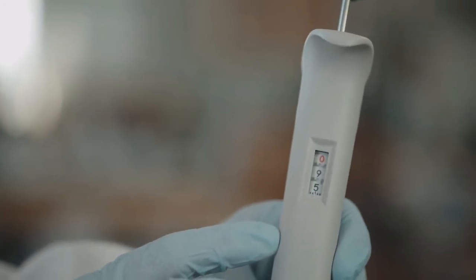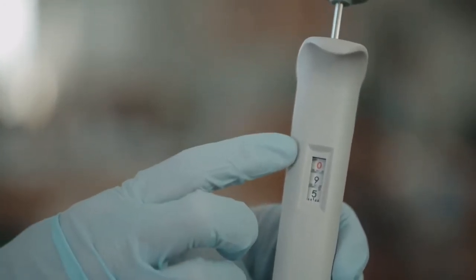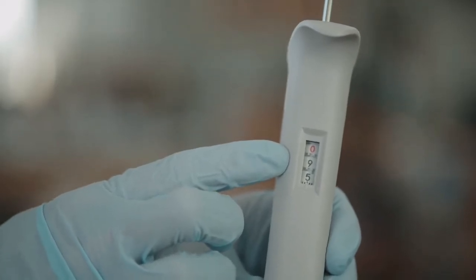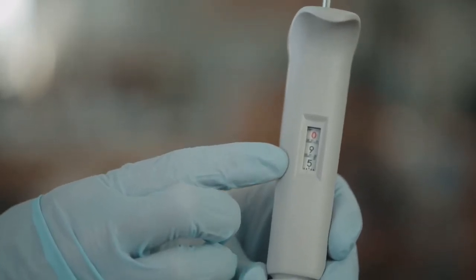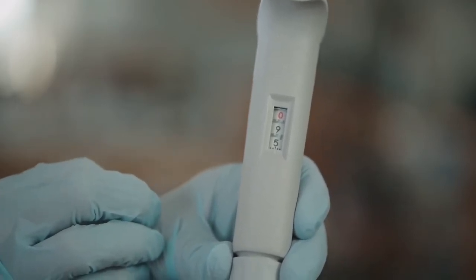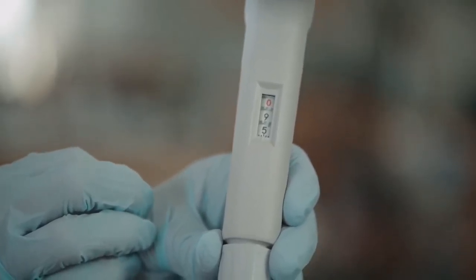For this P1000, the upper digit in red represents the thousands place. The next digit down represents the hundreds place. The digit on the bottom represents the tens place. This micropipette is set to take up 950 microliters.